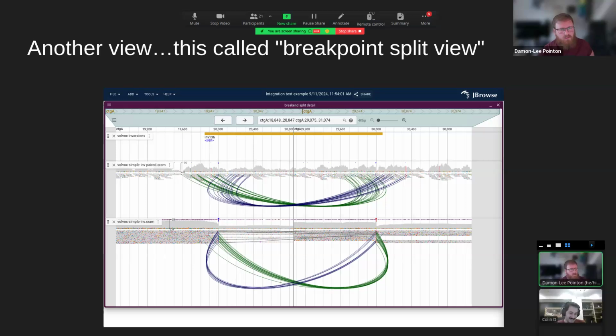And I think somewhat related to that, a lot of the files have an optional index file that you can also upload, don't they? Yes, a lot of the indexes are actually pretty much required if they are available. For example, we need a BAM index and we need a Tabix index for file types that are indexed. So they won't necessarily help performance in that way. They'll just be needed.